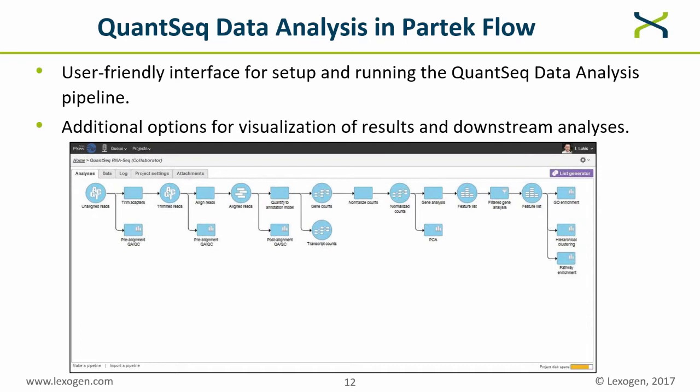By integrating this pipeline into the user-friendly data analysis interface on Partek Flow, QuantSeq customers can easily access and run this pipeline to analyze their QuantSeq data, even if they have no previous experience with bioinformatics.